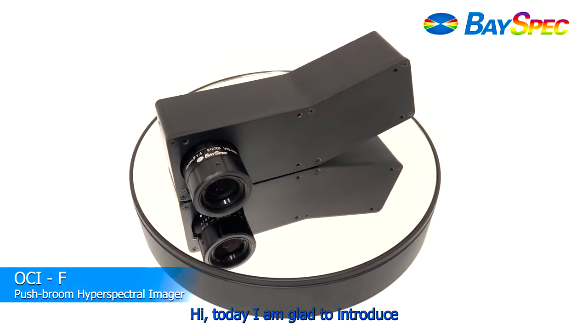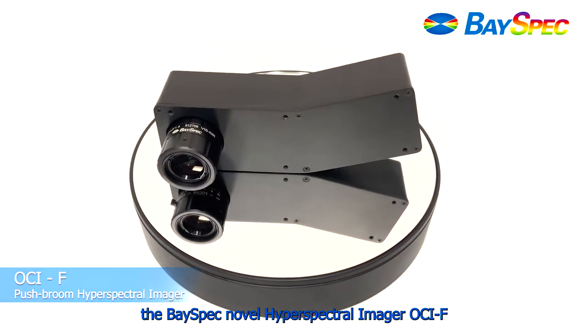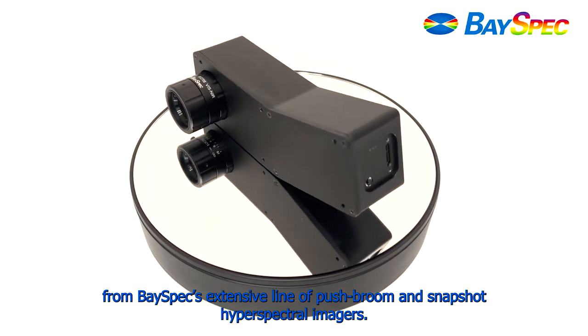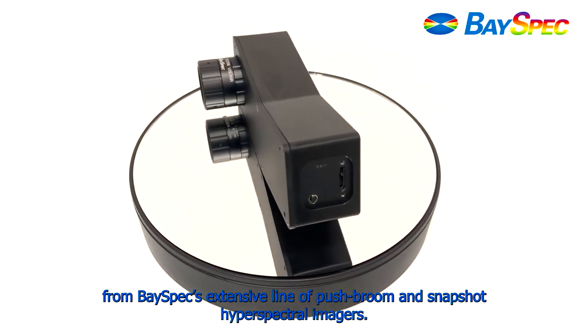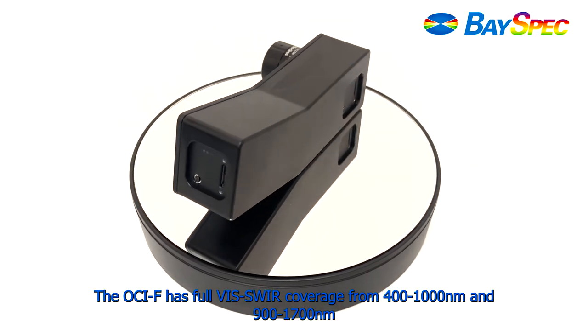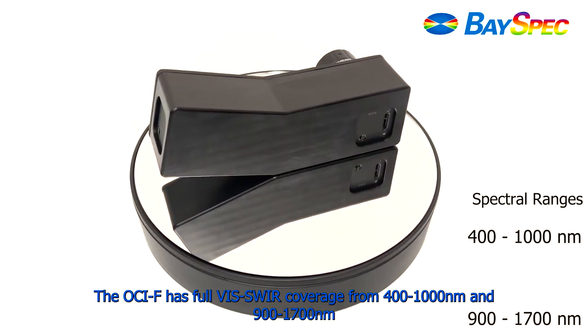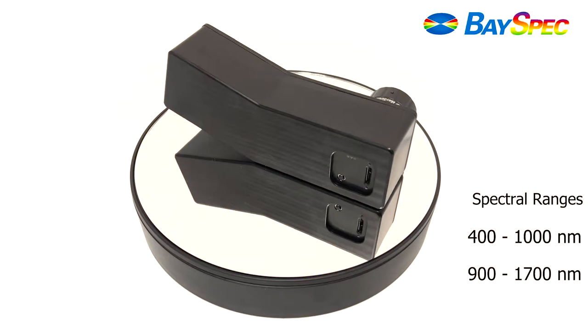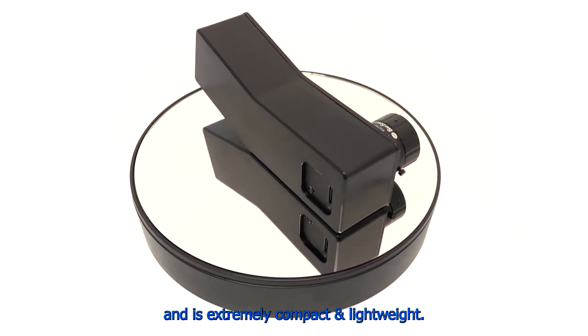Hi, today I'm glad to introduce the BaySpec Novel Hyperspectral Imager from BaySpec's extensive line of push broom and snapshot hyperspectral imagers. The OCIF has full visible to SWIR coverage from 400 to 1000 nm and 900 to 1700 nm, and is extremely compact and lightweight.